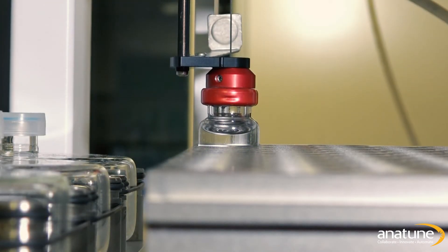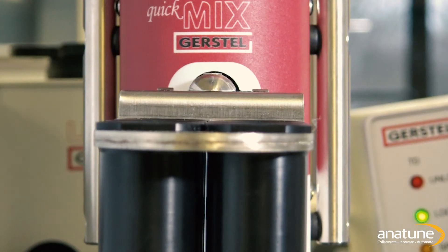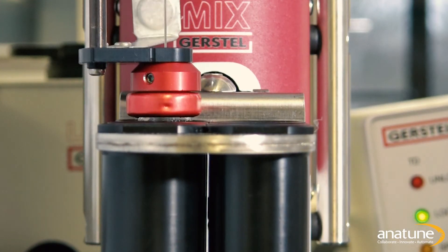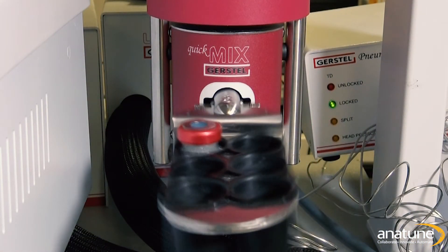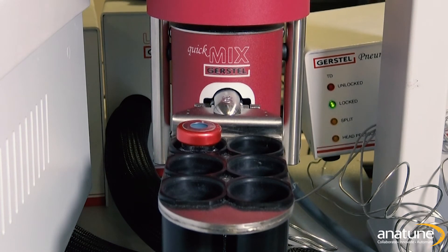When you have the most powerful separation tool in your organisation, varied and difficult samples are bound to come through your lab on a regular basis. Versatility and flexibility are of paramount importance when faced with such a wide range of analytes and matrices. This is only possible through the automation of both sample preparation and introduction.